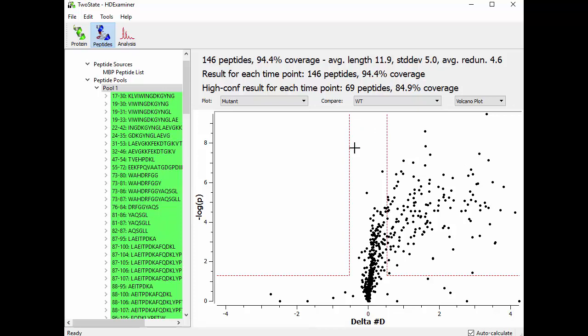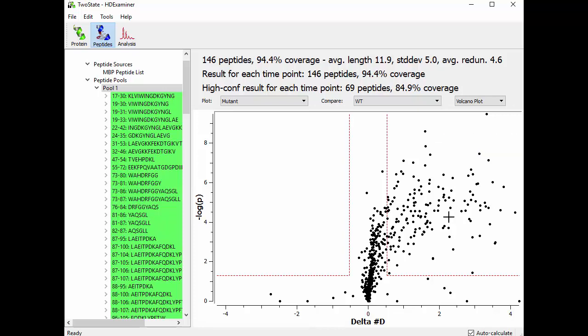And so any point that's in this quadrant or this quadrant here are the ones that we can be pretty sure are statistically significant differences. So for example, this one here, the delta number D is quite big. It's more than three. And the P value is very low. It's on the order of 10 to the minus 8. So this one, we can be pretty sure is a statistically significant difference.